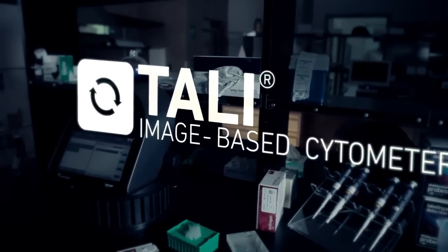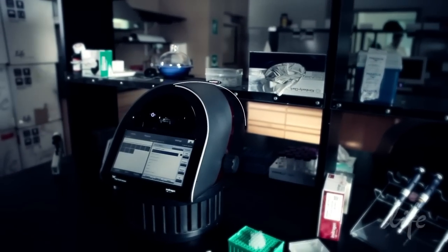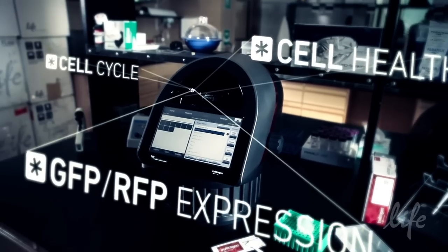The TALI image-based cytometer is a benchtop cell analyzer designed for quick, simple, quantitative analysis of cell health, GFP or RFP expression, cell cycle and much more.